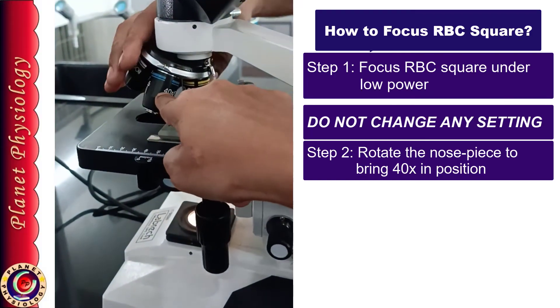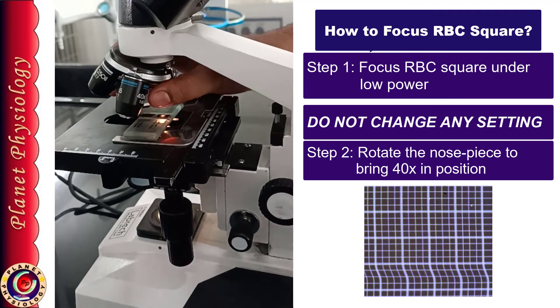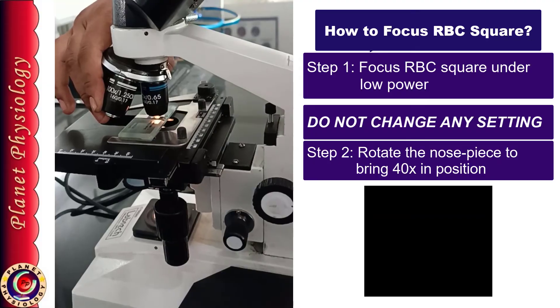I repeat do not use any of the screws. Just rotate the nose piece of the microscope to 40x position.